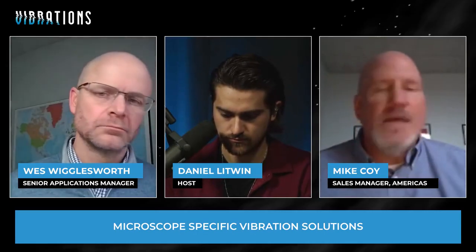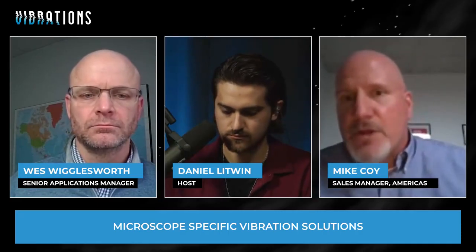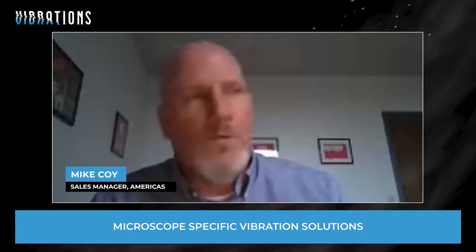As that image acquisition time extends, the stability requirements become greater and greater. So it goes beyond magnification. And that's where the active systems that Wes talked about really become critical. We really have to have a stability way beyond what the instrument was capable of requiring 20 years ago.